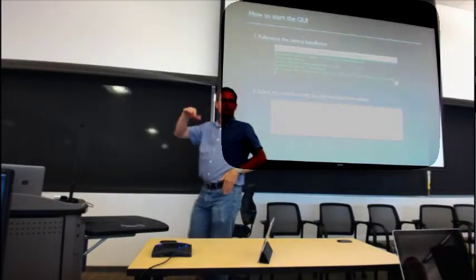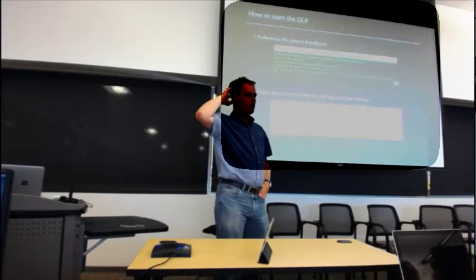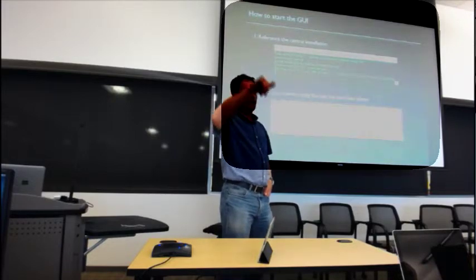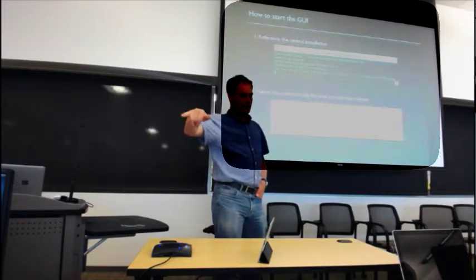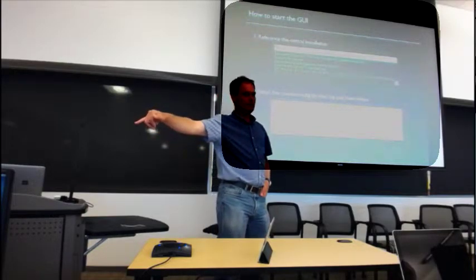By the way, all of this is also on my website. On the website, the Scratch is not slash scratch, but slash reg slash d slash psdm slash CXI slash experiment whatnot slash scratch, and then within that you can do something. Is there any experiment there? No, only this experiment. Only the one that we have permission for. Just for this, 84914, whatever it is. This may be also the problem.